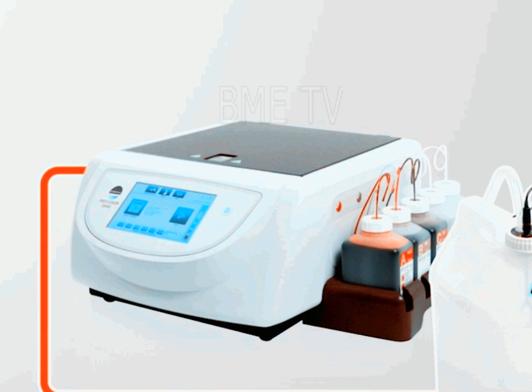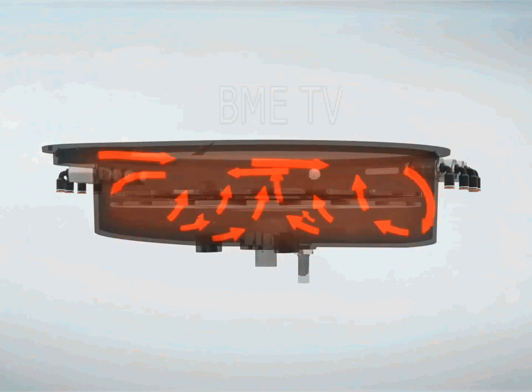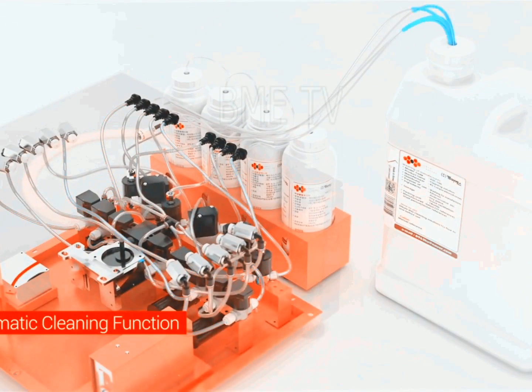Several vendors use strategies that limit the initial volumes of reagents required. Examples include employing small, walled-off reaction chambers on the slides or permitting control of the amount of reagent that is dispensed. One vendor employs a unique waste strategy that produces no liquid waste because all waste is collected in an absorbent material within the waste cartridge and disposed of as solid waste.